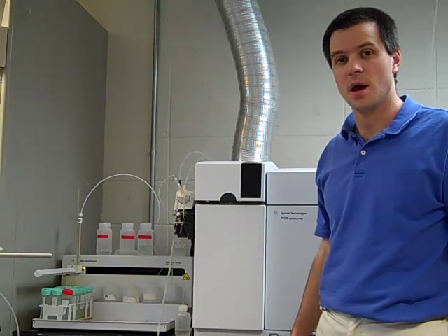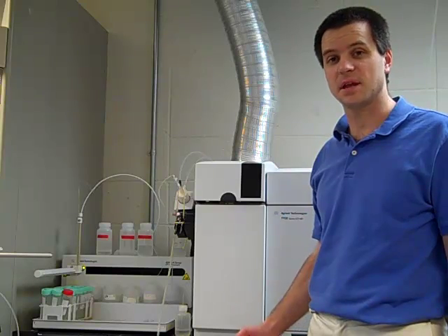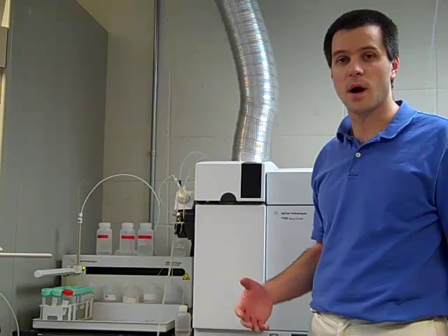This instrument is what we refer to as an ICP-MS, or inductively coupled plasma mass spectrometer. Again, like our other two mass spectrometers, coupled to either liquid chromatography or gas chromatography, the ICP-MS provides us with information about the mass of, in this case, atoms, and particularly metal atoms, as they are detected. So this particular instrument is very well suited for the analysis of metals in a variety of different types of samples, whether they be environmental samples of lake water, ice cores, sediment cores, dirt, and components of different rocks.